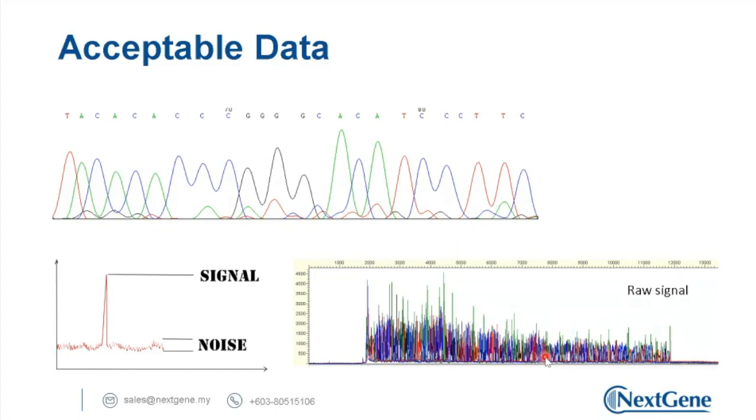resequencing. I'm not sure who you sent it to, but if you send it to us, you can request resequencing and see whether you get the same result. If there is still template, they will help you perform a repeat. If the repeat also shows it's not successful, it's not a technical problem. Then maybe it is some mutation, and we need to think about what really happened.